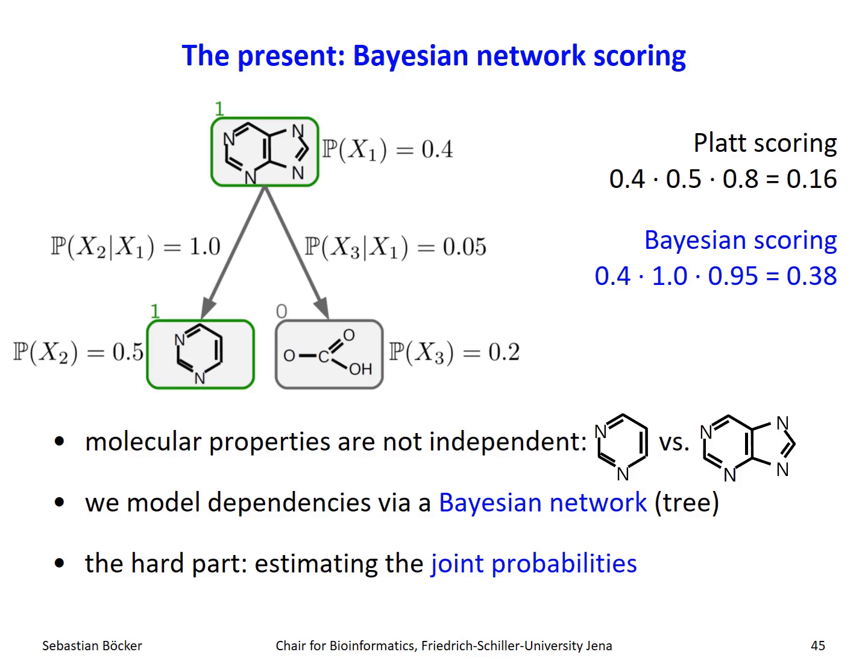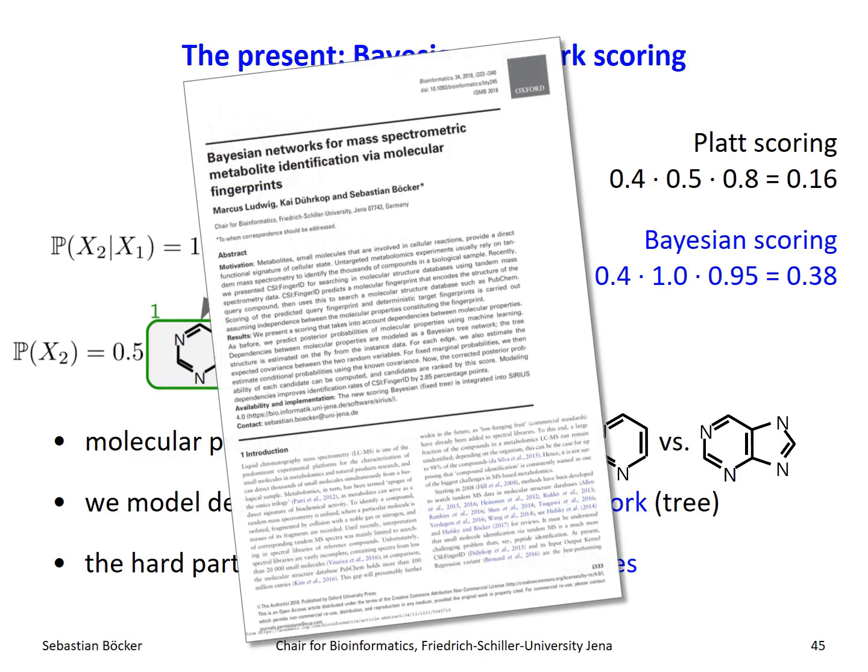And it's now also available in SIRIUS. With SIRIUS, I think 4.5, it finally became available. It's much more complicated to implement, so it really took us some time to get it to the user. If you want to know the details, as I said, it's rather complicated. There's a conference publication about that.